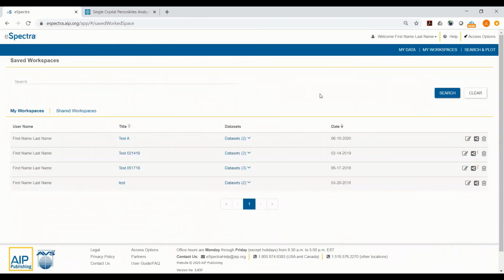If you have additional questions about how to use my workspaces or to contact a specialist, at the bottom of the eSpectra screen, you can access the help email, eSpectrahelp@aip.org.